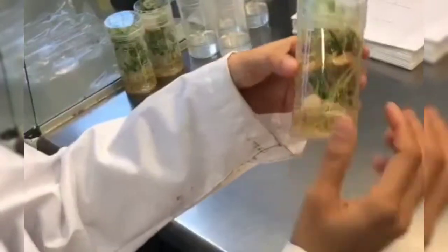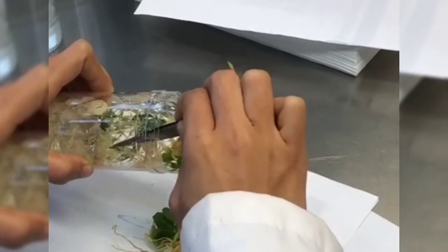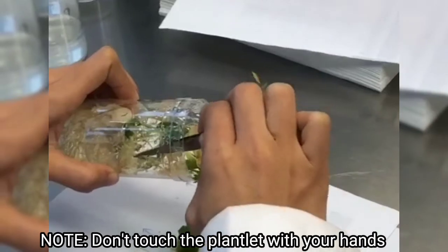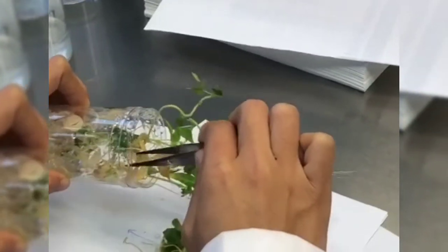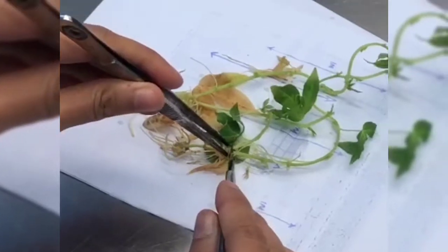Open the jar lid gently to transfer the plantlets to the sterilized paper. Make sure you don't touch the plantlets with your hands and use a tweezer to gently remove the plantlets from the jars.